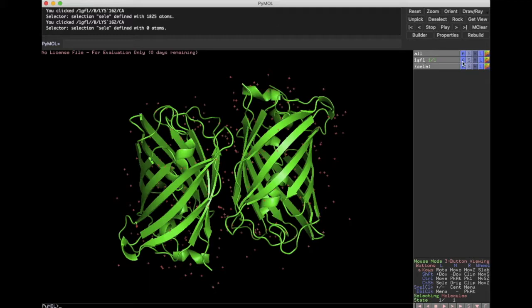If we use these boxes on this level, it is going to apply to all of the atoms and molecules that were loaded as part of this file. You can actually load multiples of different PDB files. If you had multiple loaded, you would see the 4-letter designations all the way down.